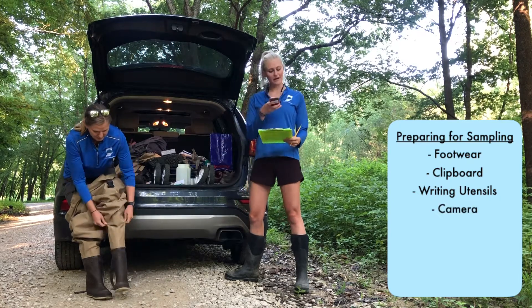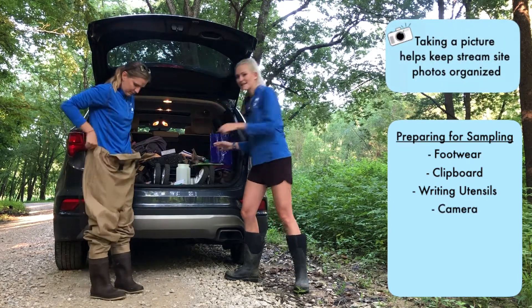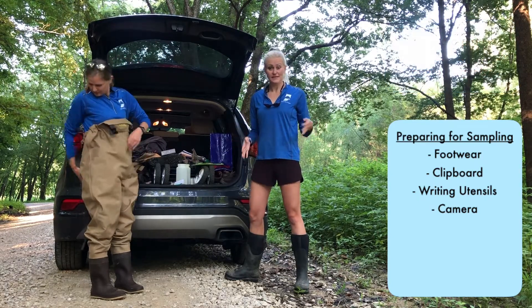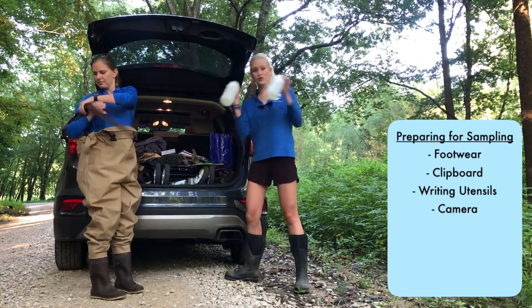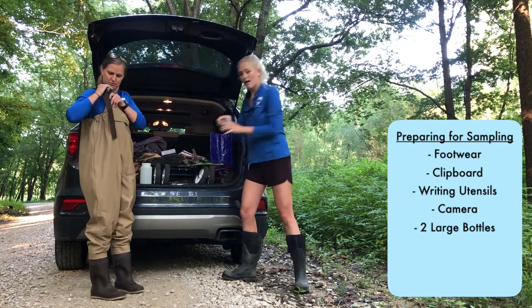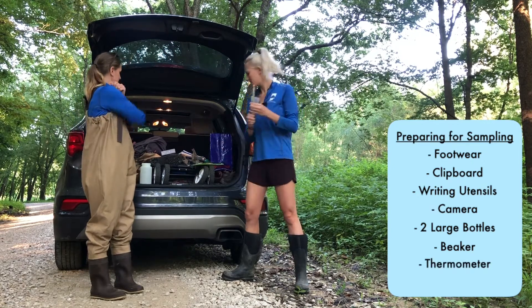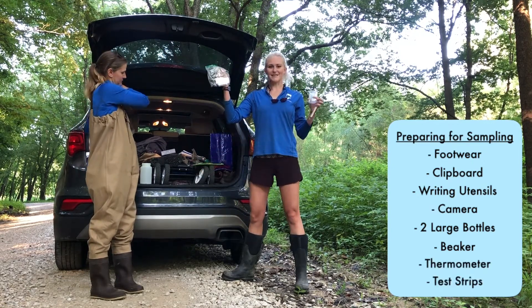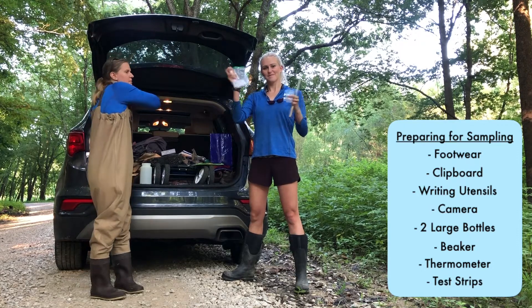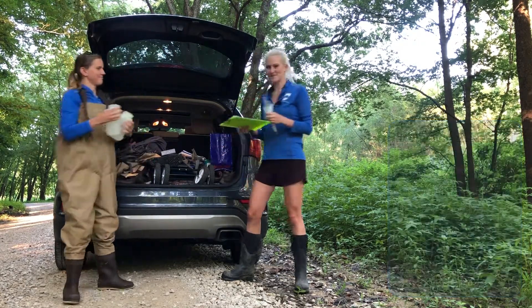Then I want to take a picture of my data sheet. Finally, we need to grab whatever supplies we need to sample the stream. Those include our two large bottles, our small beaker, a thermometer, and our test strips. Once we have all that stuff, we're all ready to head down to the stream. Let's go.